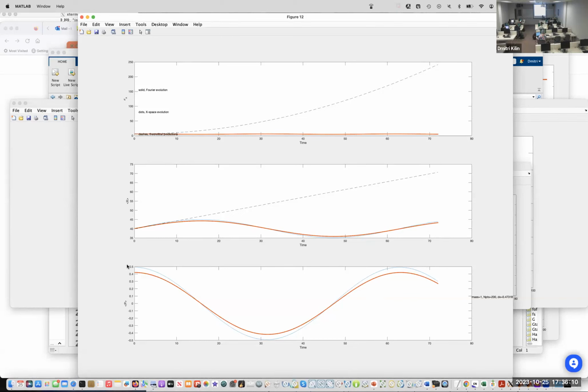There are two ways. One is to just make a point on a graph each time it comes through, or another, a little more long-term working, to accumulate all data points into a single data set, like an array or a file, and then plot on demand when it is needed.